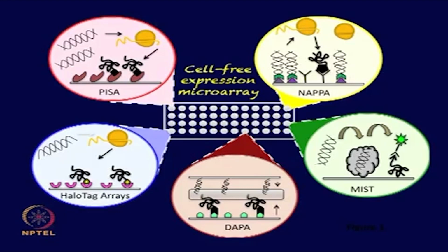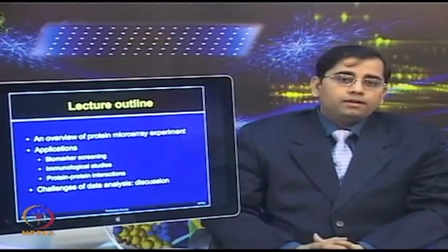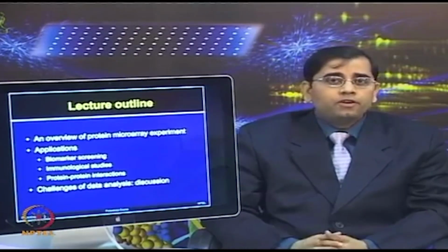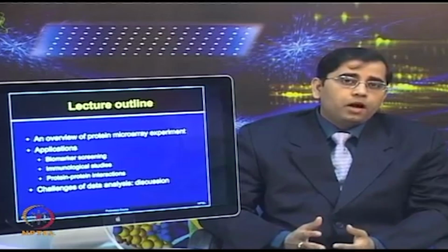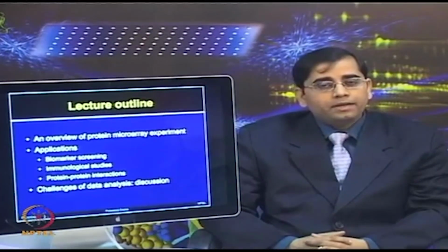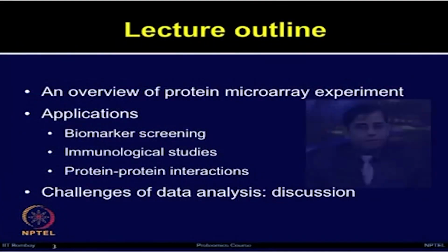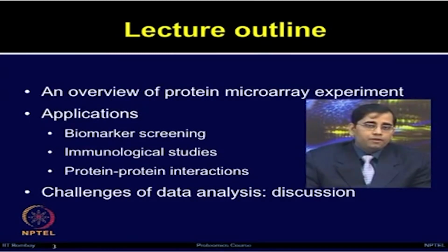So, in today's lecture, we will talk about an overview of protein microarray experiment. First of all, I will give you a broad overview of how any type of protein microarray platform can be used for different types of applications. I will then describe a few applications very briefly by taking some case studies. This will just give you an idea of how these platforms are used for a wide variety of applications, including biomarker screening, immunological studies, as well as protein-protein interactions.